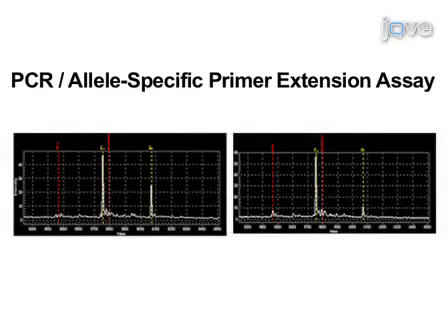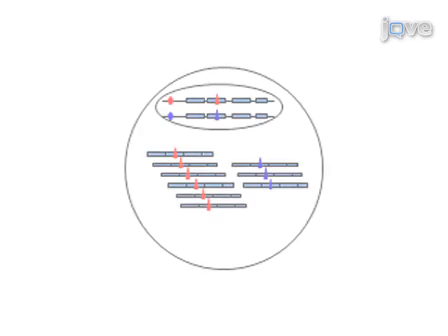Next, primer extension products are analyzed by mass spectrometry in order to quantify the relative abundance of the two alleles. Results are obtained that show whether the original DNA variant associated with a disease is also associated with a difference in gene expression based on quantitative allele-specific measurements by mass spectrometry.